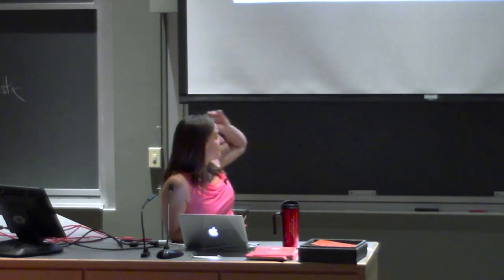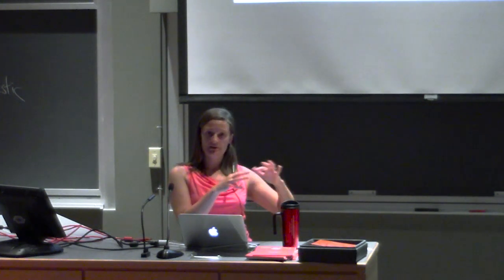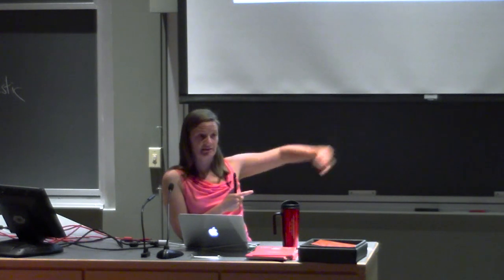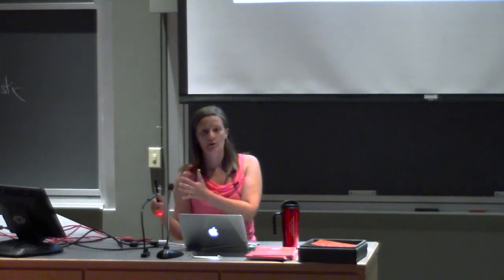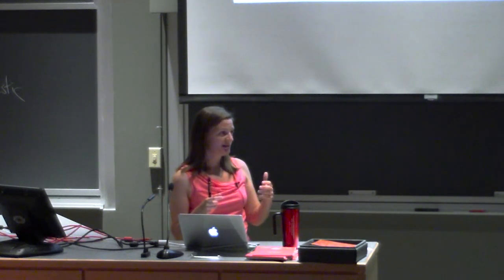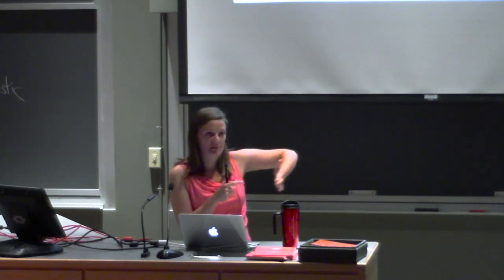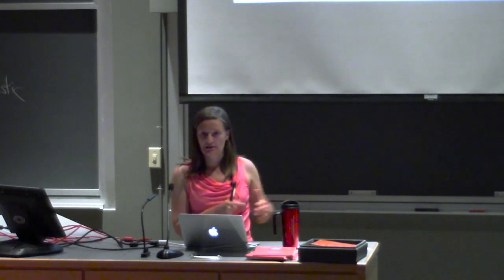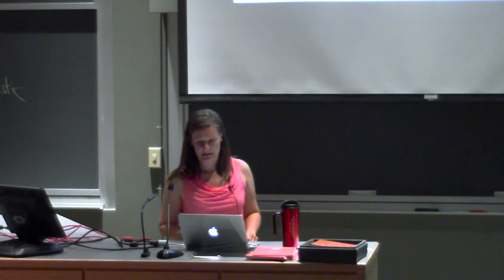One of the things my lab manager has been doing while I've been gone is making a series of maps where you can adjust all those tuning parameters, exploiting them to give you maximum sensitivity, so as much signal for your available gas as possible, versus where you might tune the machine to get your very best peak shape and precision. Somewhere in there is a sweet spot where you can bump up your sensitivity as much as you possibly can, at the limits of the precision that you actually need. That's been another part of getting the precision in our lab.